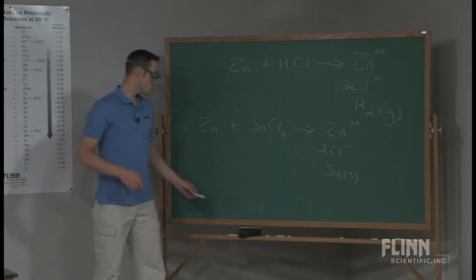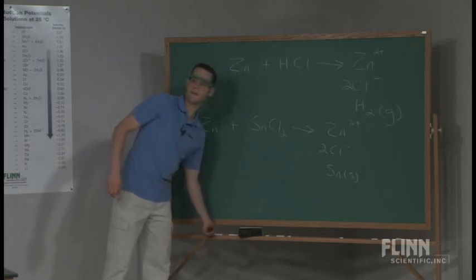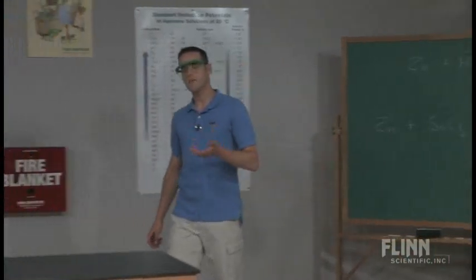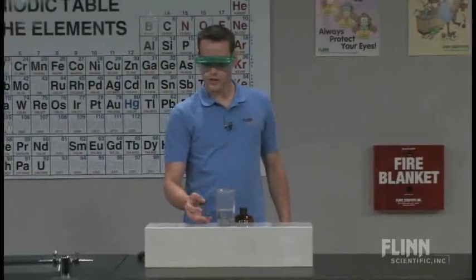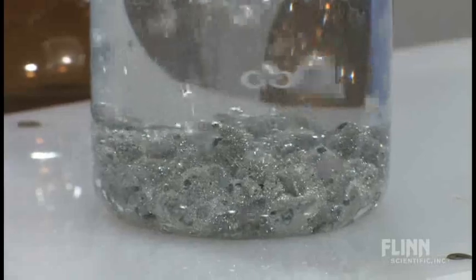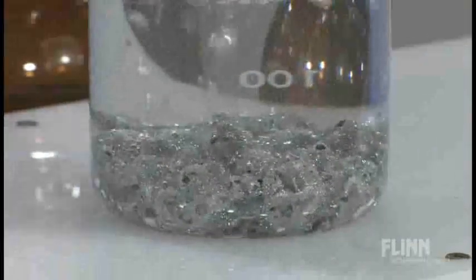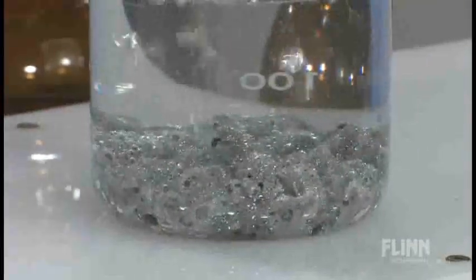So you have two single displacement reactions happening simultaneously. If we can go back to the close-up shot, you can start to see those crystals are growing a little bit better and you also notice that the bubbles are sort of coming out from inside of the metal. Well, we're starting to get cavities on the inside there.